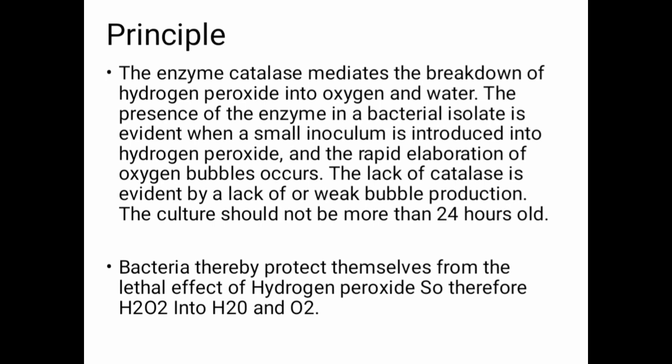The main point we should know is that the culture should not be more than 24 hours old, because the enzyme is not stable for a longer period, so the result will be falsely negative or falsely positive.